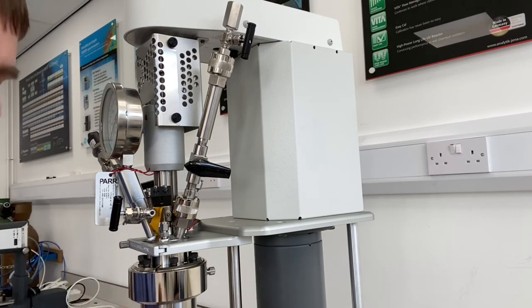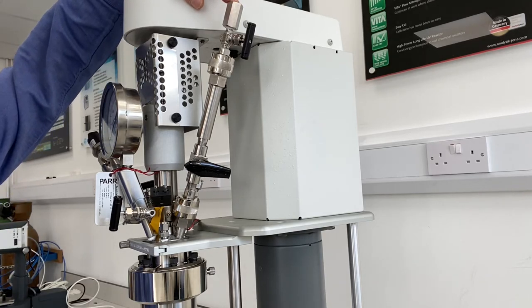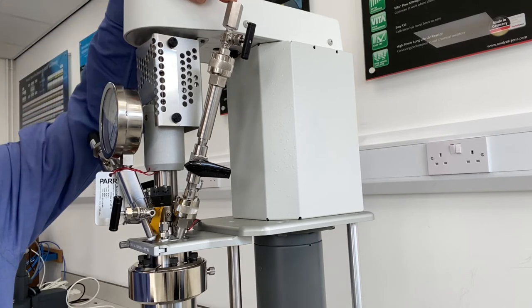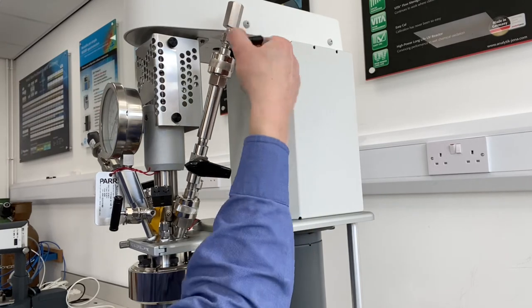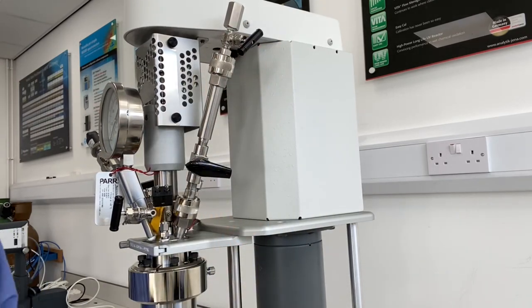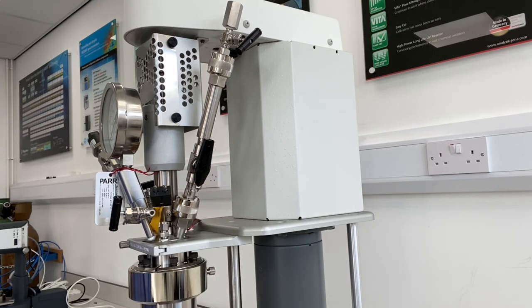You bring your vessel contents up to the desired temperature and pressure. When you're ready, you apply a gas pressure on the top of the XCAD — a pressure that is greater than the pressure inside the vessel. You open the valve to put the system under pressure, and when you are ready to inject the catalyst you simply open the ball valve. That will push the catalyst in, and you now have your catalyst inside the reactor at the desired operating temperature and pressure.